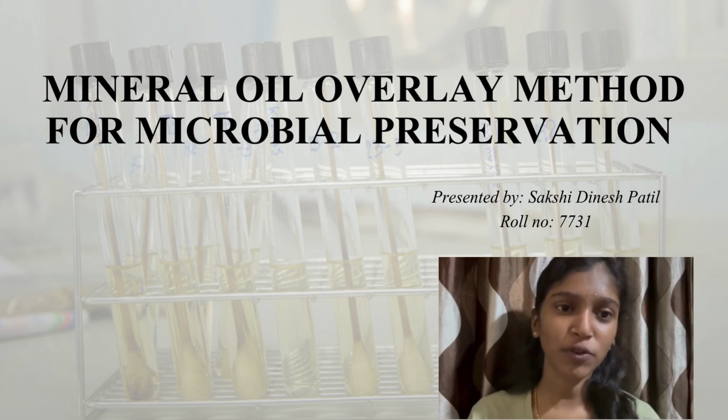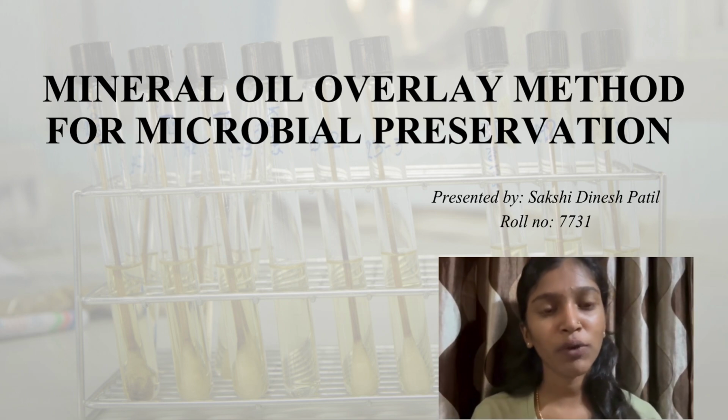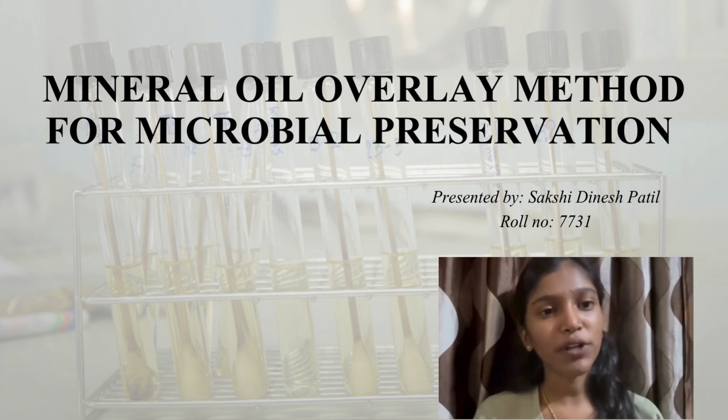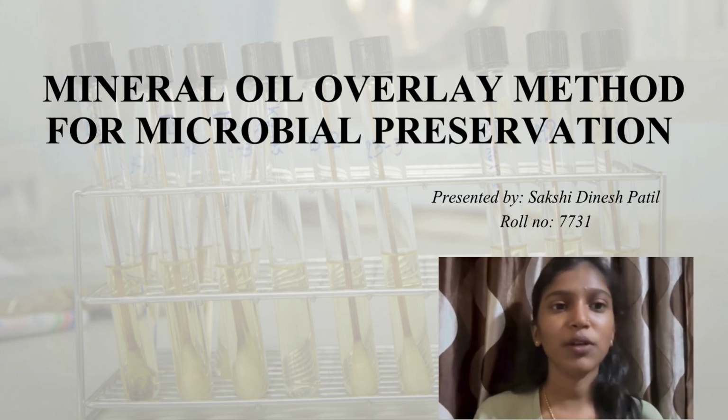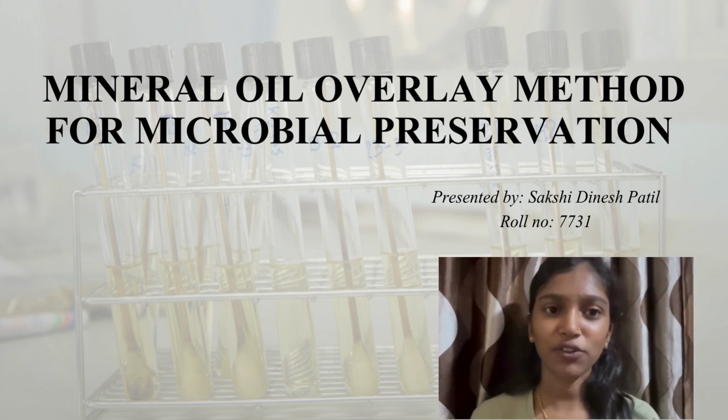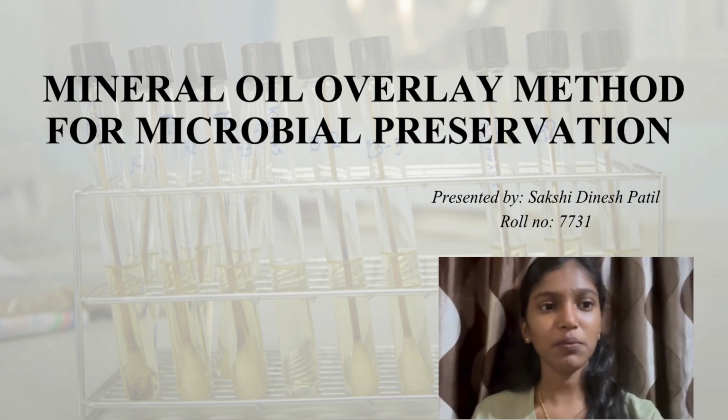Today I am going to present on the topic mineral oil overlay method for microbial preservation. In this presentation, I am going to explain what is preservation, what is the method, procedure, requirement and application, advantages and disadvantages of microbial preservation.